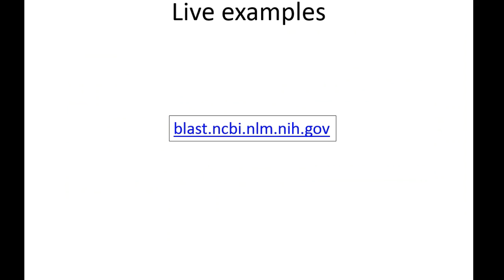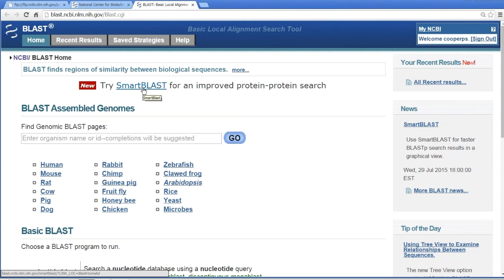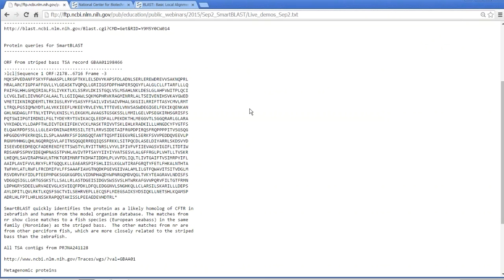I'm going to do one example to keep this a short webinar. I'll go to a web browser. There's the BLAST page with a link to SmartBLAST. If you follow the materials link you can do this yourself — there's a text file with example sequences. This sequence is from the striped bass transcriptome, generated by finding an open reading frame on one of the assembled RNA-seq sequences. In essence, this is an unknown protein.